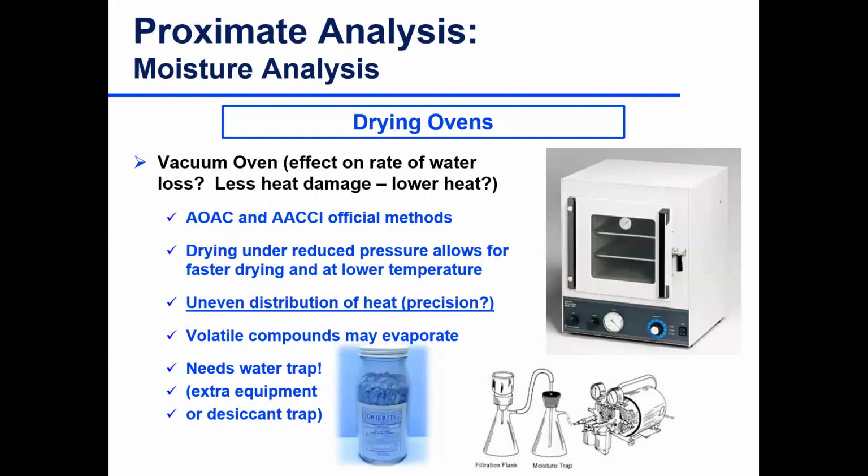This is a vacuum drying oven, and so that speeds things up. This is another driving force for evaporation. And so you might get along with a little lower temperature, a little less time perhaps, if you're in a vacuum oven. So you get less degradation of the product, probably less artifacts when you use a vacuum oven.